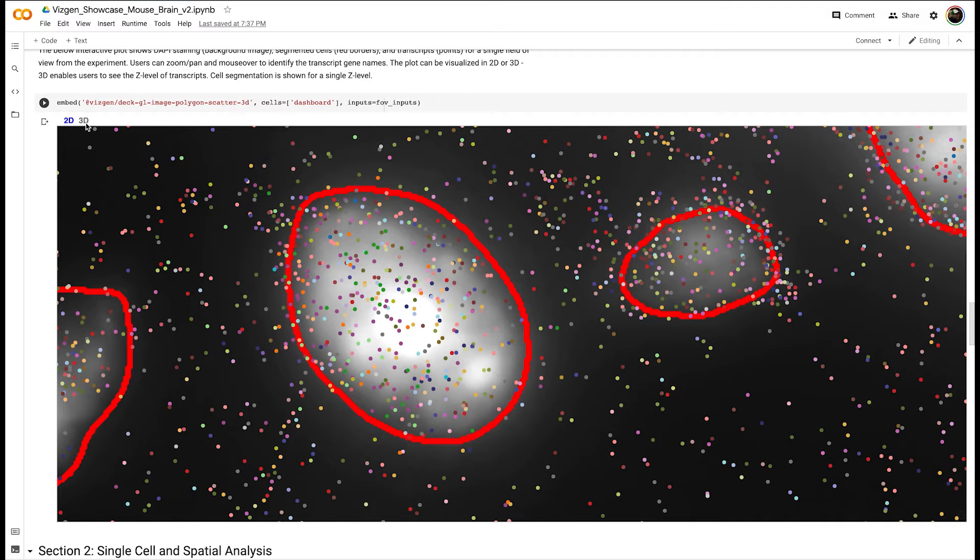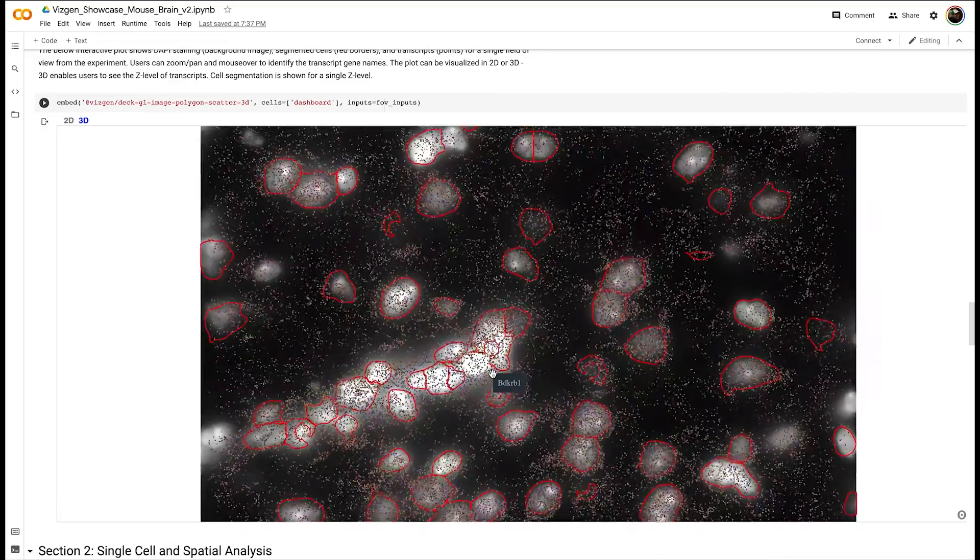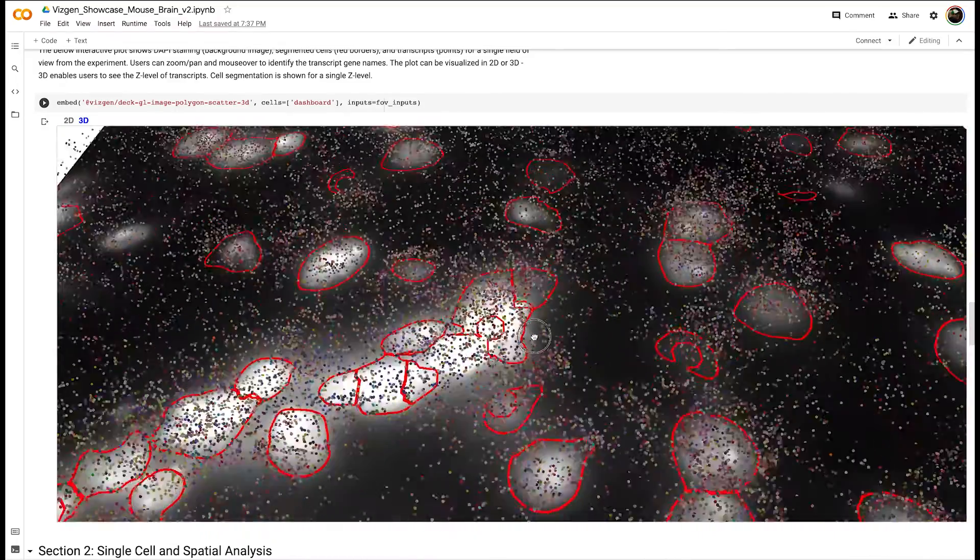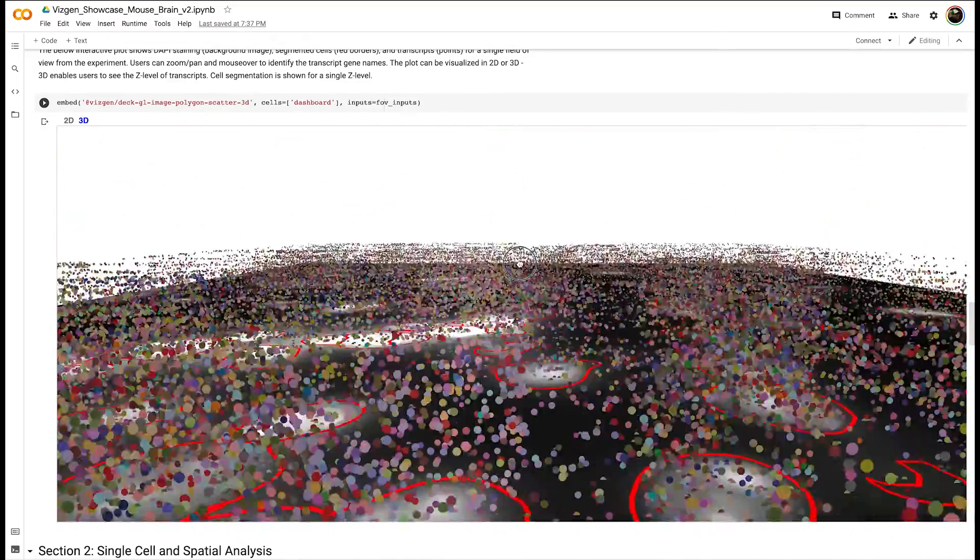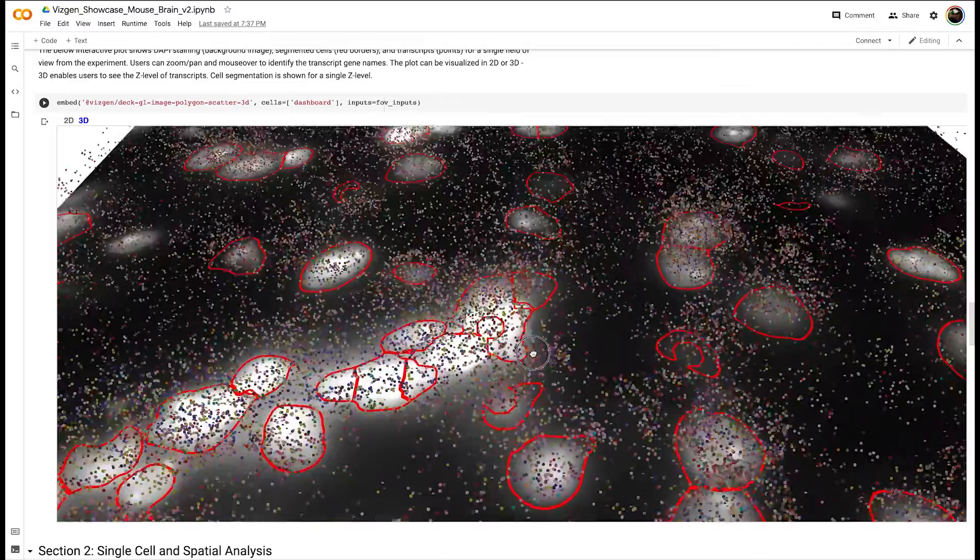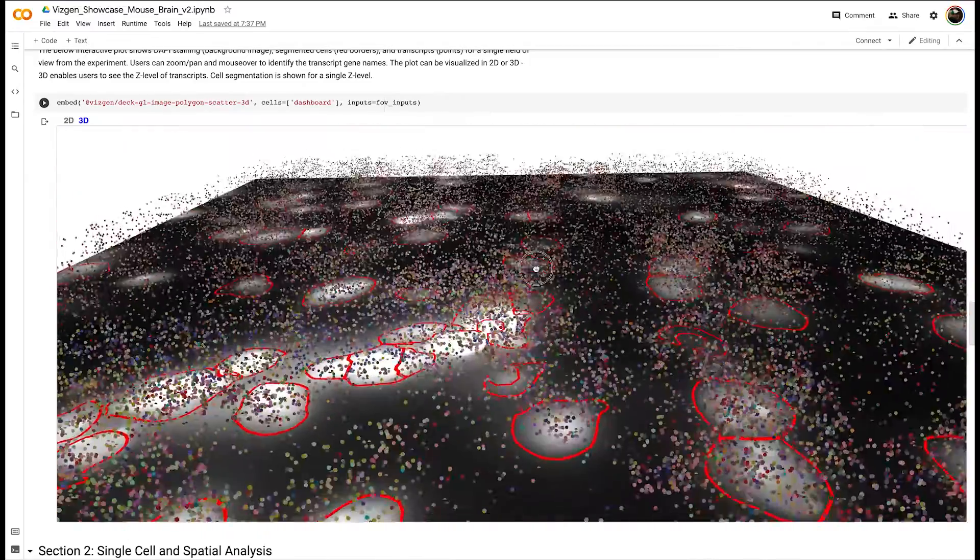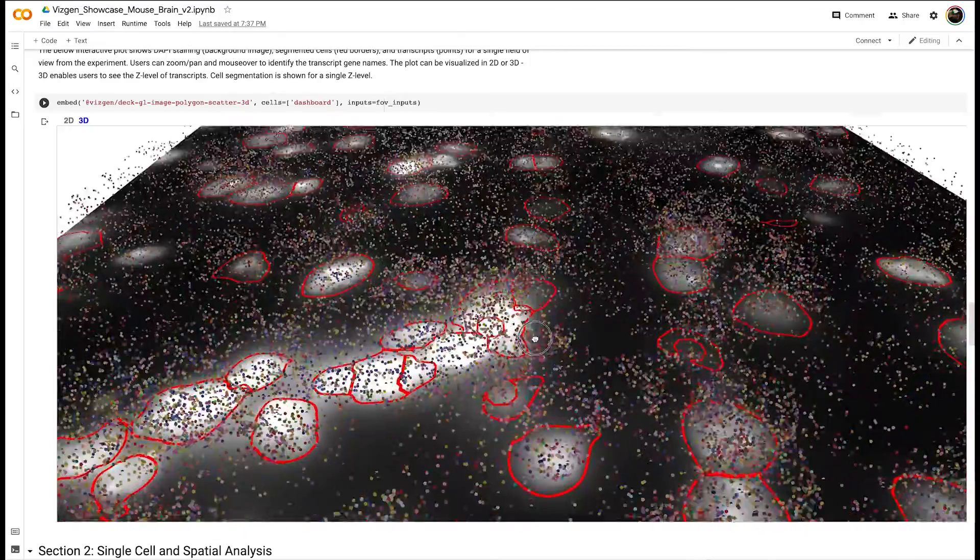We can also switch to a 3D view to be able to see three-dimensional data from our Z-stacks from a single field of view to give you an idea of the complex three-dimensional nature of our MERFISH data.